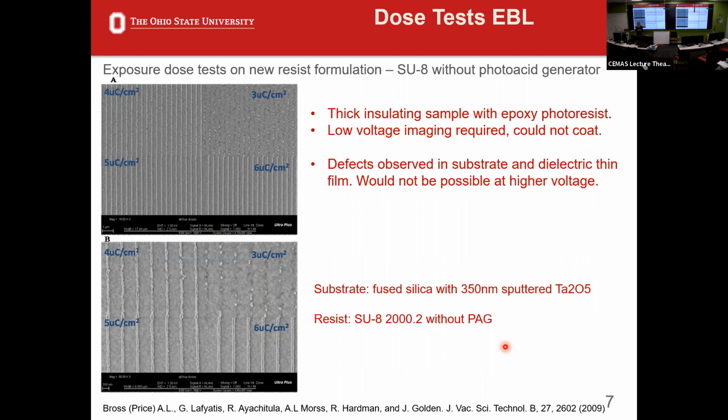But one of the things that's really cool with this particular microscope, and I'm sure you guys already knew this as microscopists, I did not know it, is that, obviously you can get a whole lecture into charging and positive versus negative charging and how that works, but you can step this microscope down by 100 volts at a time. So the cool thing is that you can find that charge neutral point without coating it, without putting anything else into the chamber, flooding it with water, or in our case nitrogen or whatever.